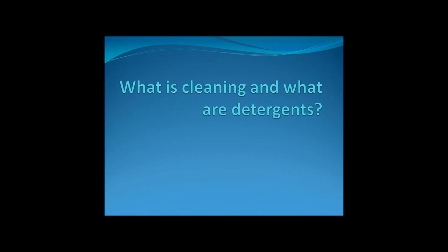Okay, so moving on, we've summarised the regulatory information, but what are disinfectants and detergents, and what do we mean by these terms? So let's begin with detergents and cleaning.